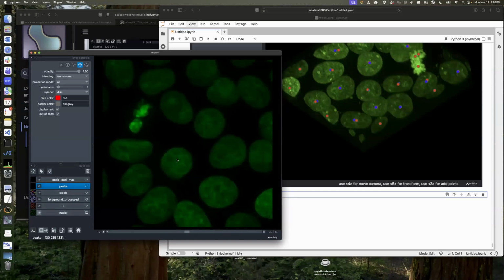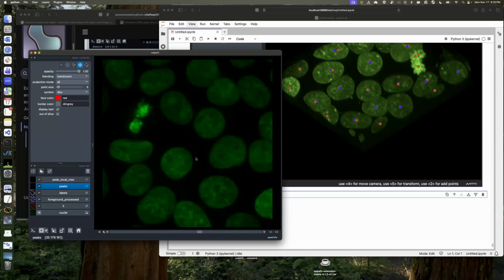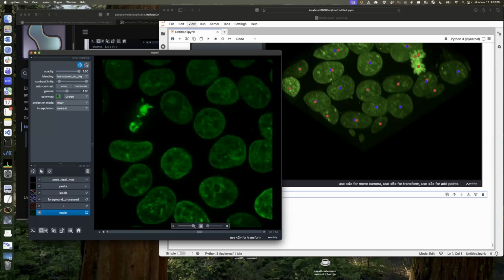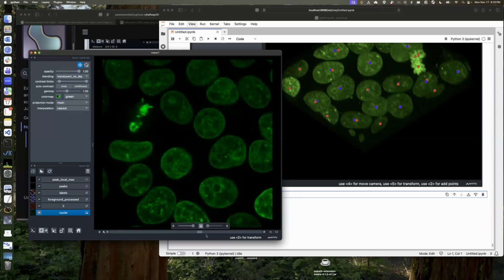And also just to give you a sense of what it looks like on the data. So now we're doing thick slicing. You can see that it's a little bit blurred, but that's because every plane we're looking at is taking the 10 planes forward and the 10 planes back as it's rendering. And you can adjust how you want that to look. And then, of course, you can just fix it back to just one plane at a time or more planes averaged together. So this can be a pretty useful trick sometimes.